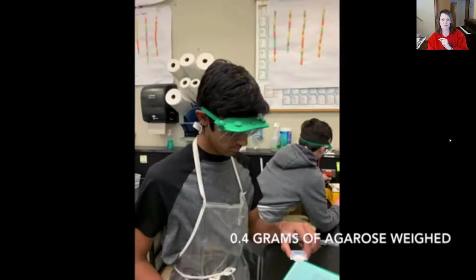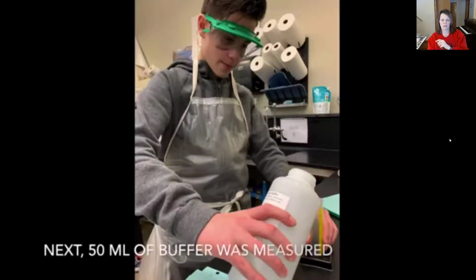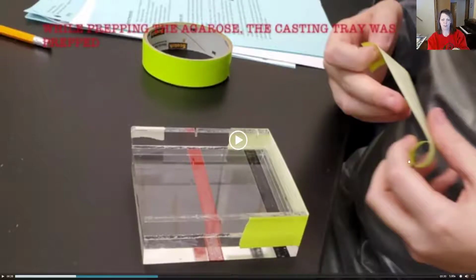This is the agarose that you need to mass on a balance and put into your flask. Here is a buffer that you're going to measure into a graduated cylinder. Meanwhile, this casting tray is open on the sides, but there's walls here. So you see that there's tape being put around between the walls so that you can seal it and have 4 walls when it's all said and done.